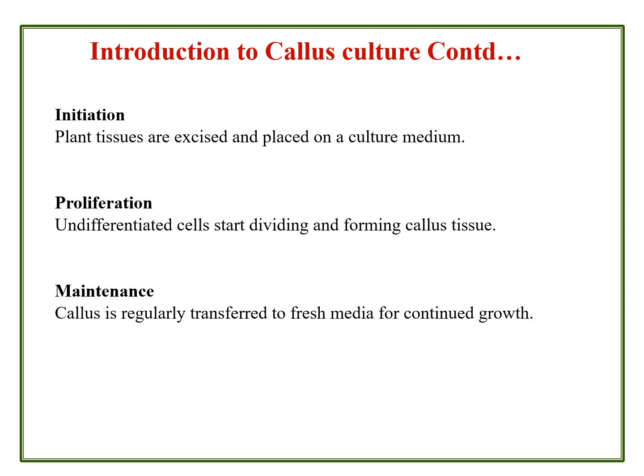Contamination in plant tissue culture is a very difficult problem, but it can be controlled through a variety of chemical sterilants, and a little bit of antibiotics are also used to control or avoid further contamination in the racks. So callus is regularly transferred to fresh media for continued growth.